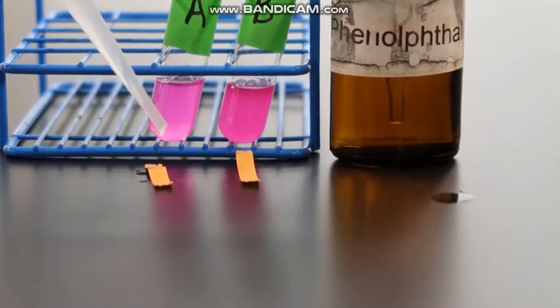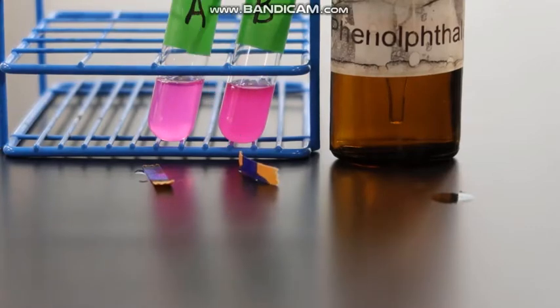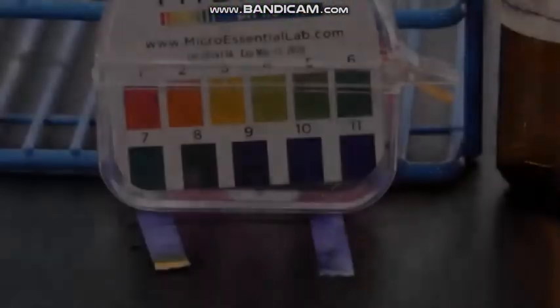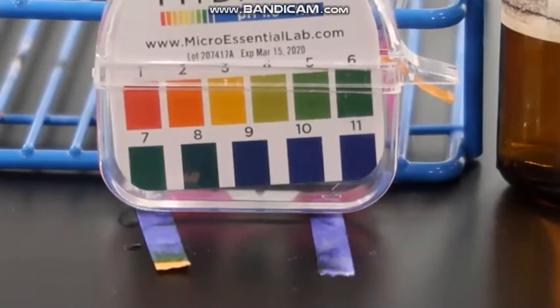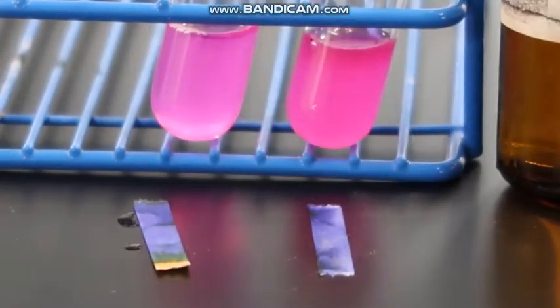Being that phenolphthalein doesn't show us exactly how basic this solution is, we are going to use pH test strips. This should give us an indication of just how basic these solutions are. At this point, it's important to ask whether or not both of these solutions should be basic and what might contribute to this.